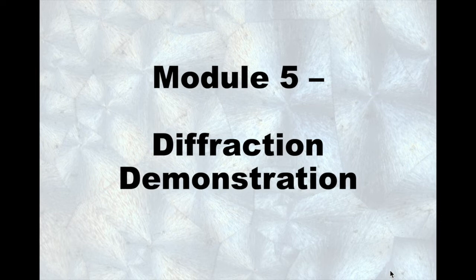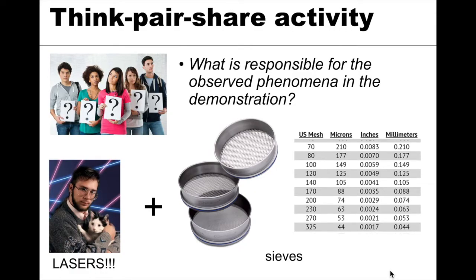All right. So before we start talking about that method for determining crystal structure, I'm going to go through a demo for you that'll hopefully get you thinking about what that method could be. I'll cut to the actual demo itself.